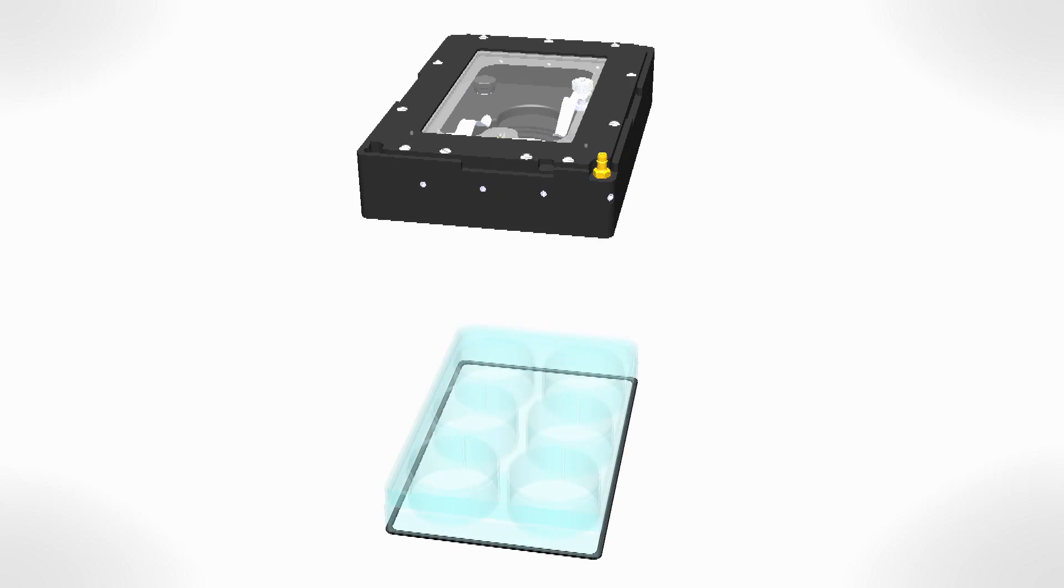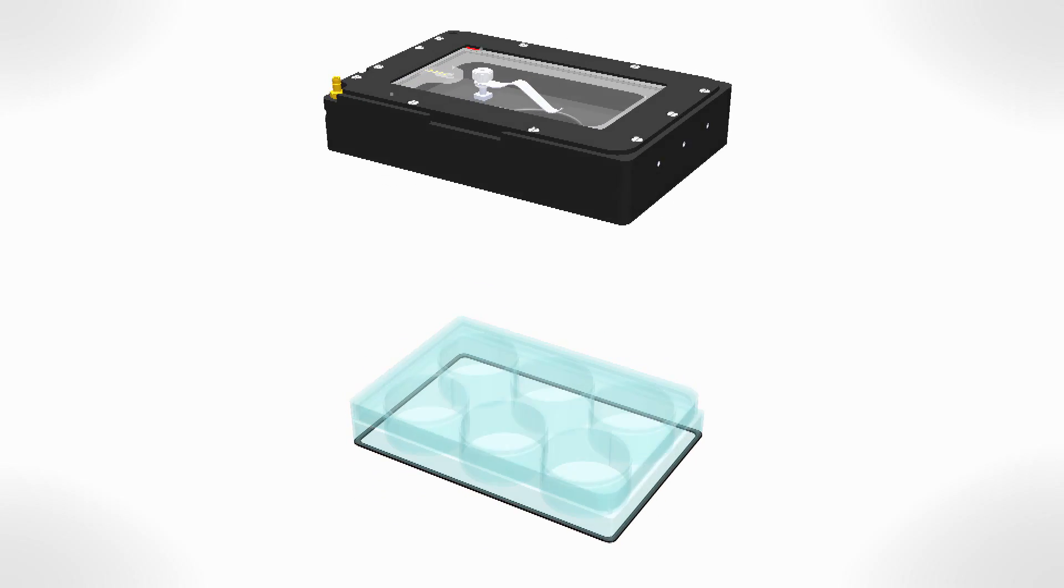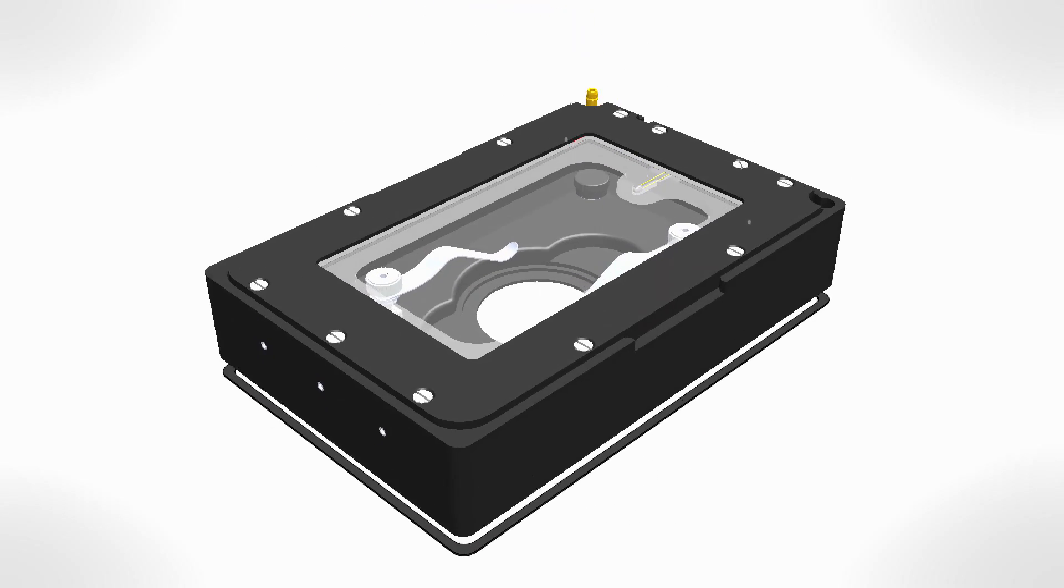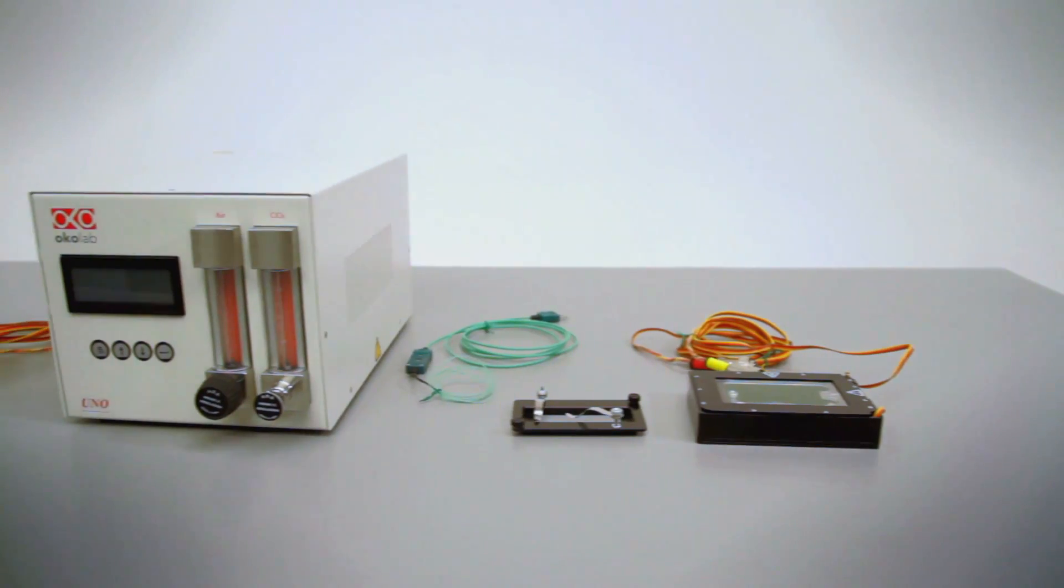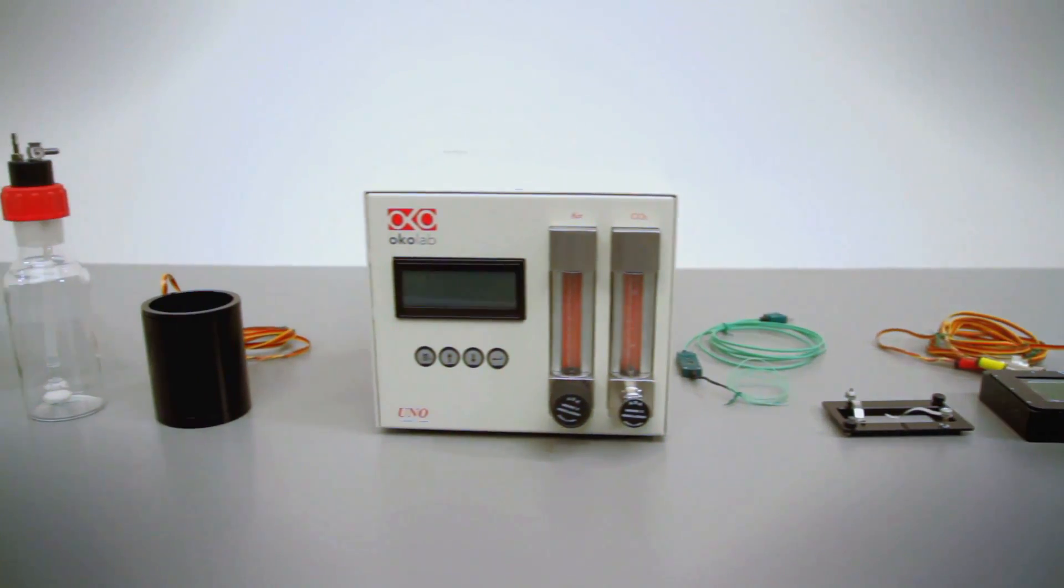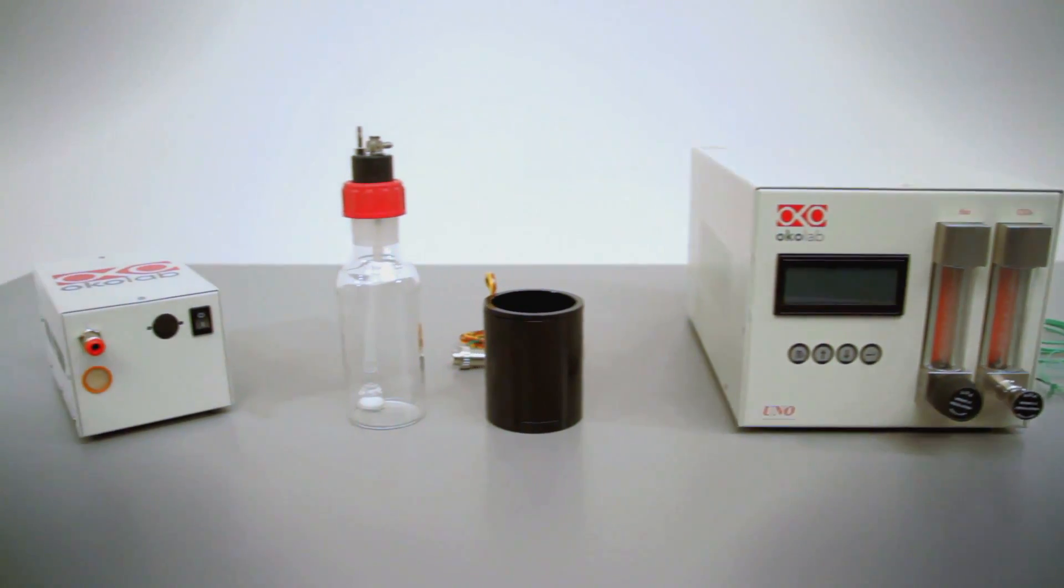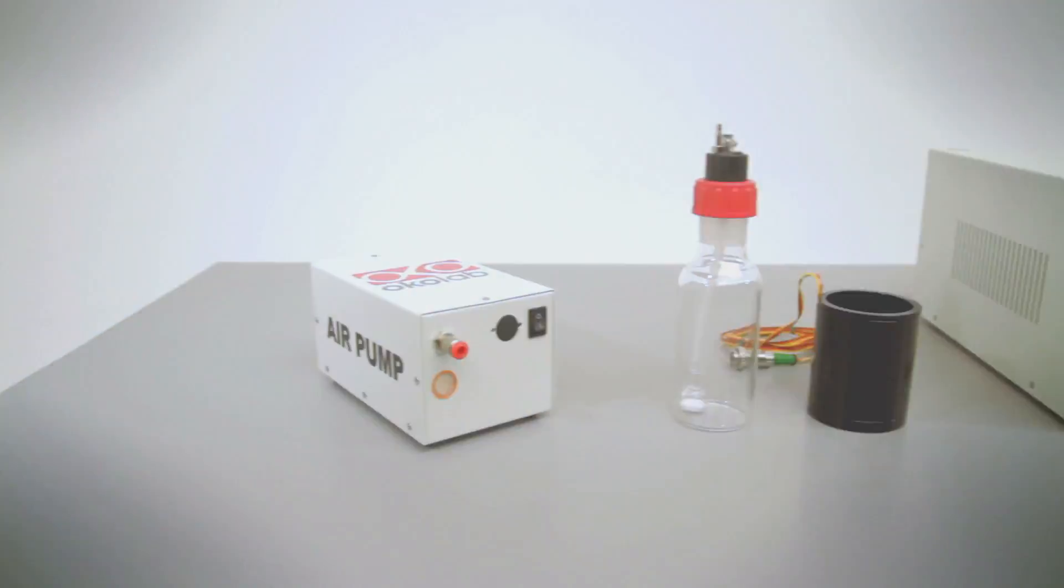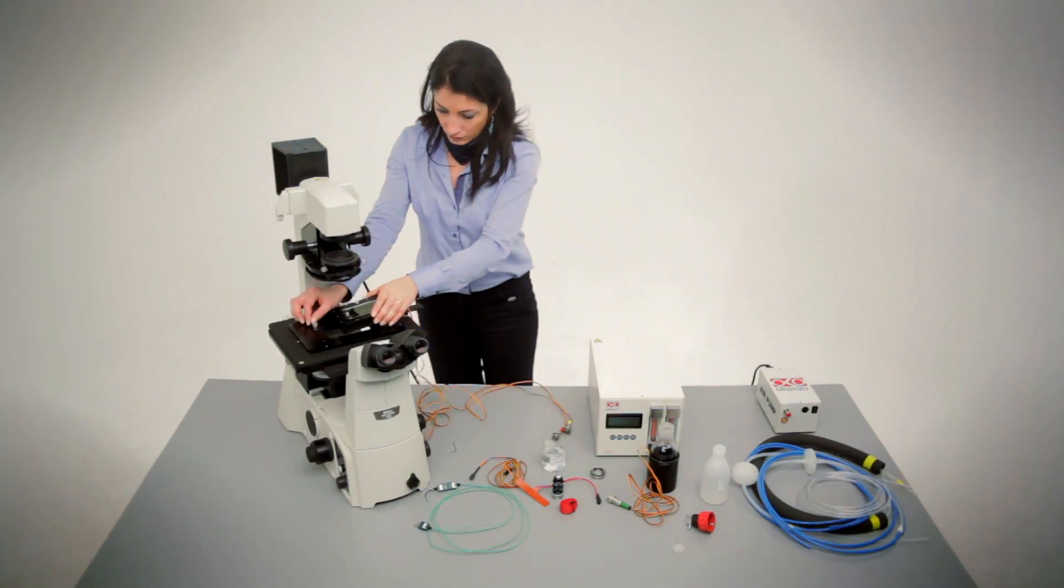UNO is a single specimen top stage incubator with the footprint of a multi-well plate. It creates a small environment right on the microscope stage at controlled temperature, humidity and carbon dioxide concentration.